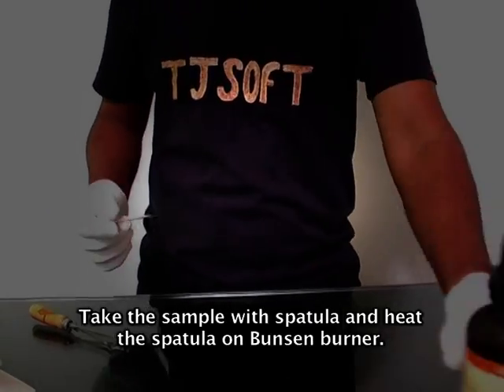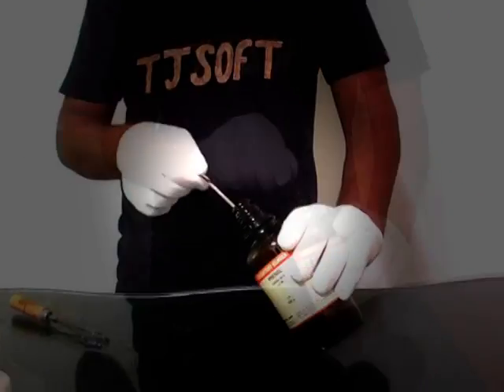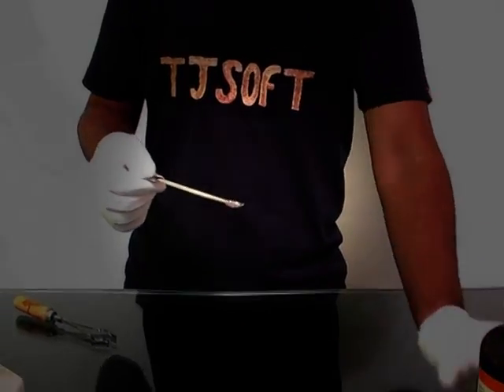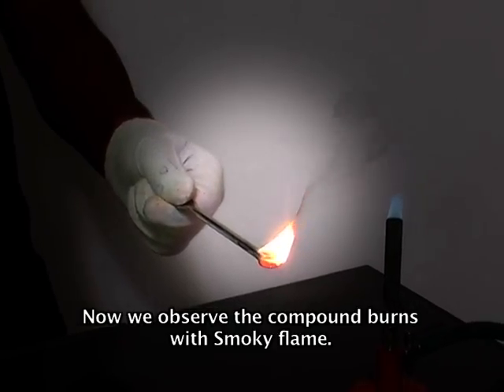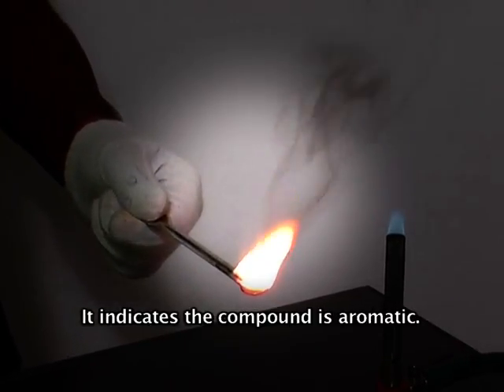Check the sample with a spatula and heat the spatula on a Bunsen burner. We observe the compound burns with a smoky flame, which indicates the compound is aromatic.